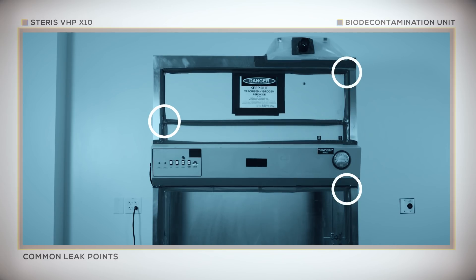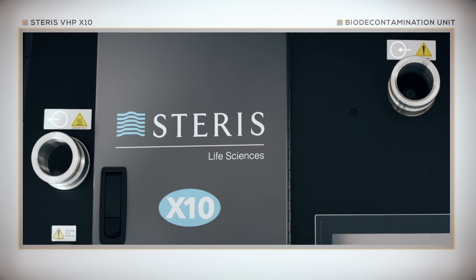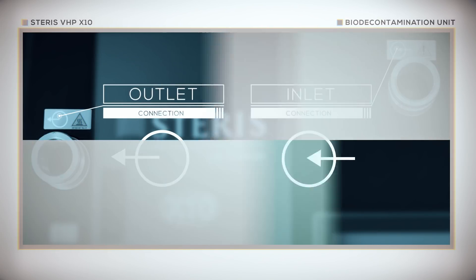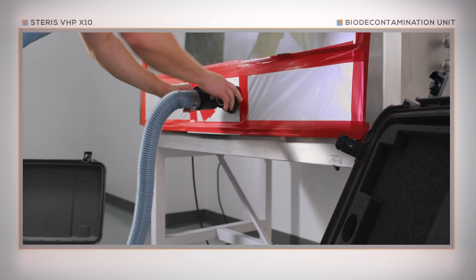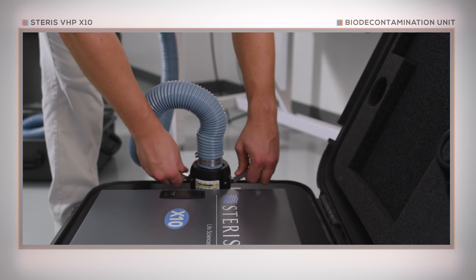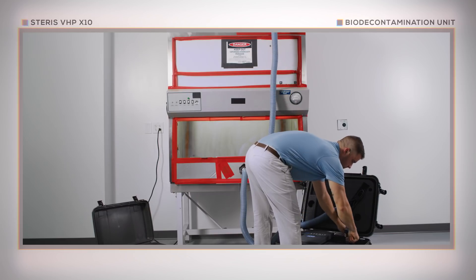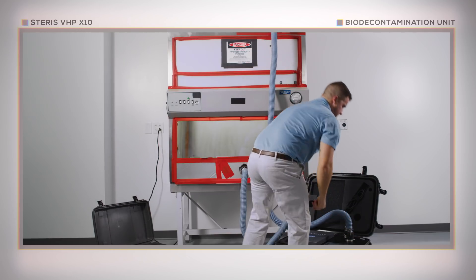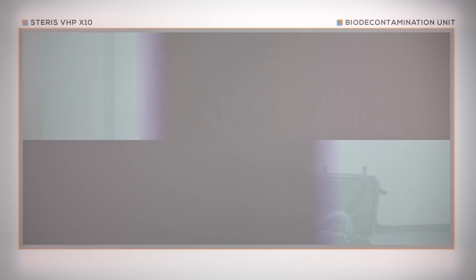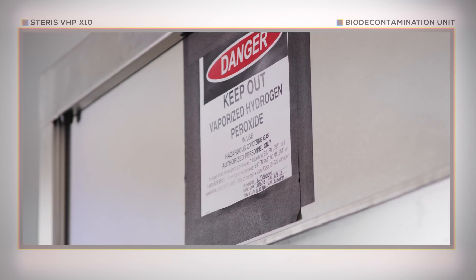Once these steps are complete and the biological safety cabinet is properly sealed, it's time to connect the X10 unit using the provided hoses. Look for these symbols at both connection points. Connect the shorter 5-foot hose to the sash plate from the X10 outlet connection. Then connect the 10-foot hose to the return frame from the X10 inlet connection. Before starting the VHP cycle, be sure to follow your facility's fumigation management plan. Install any cautionary signage and, if necessary, clear the room per the facility plan.